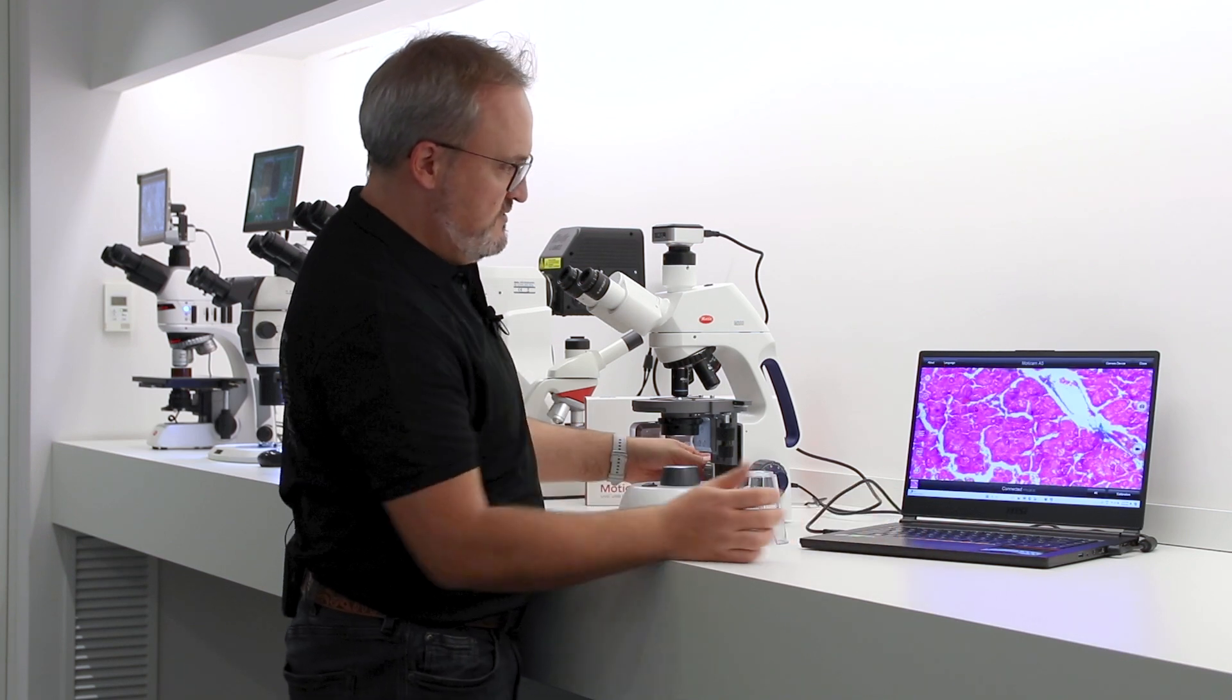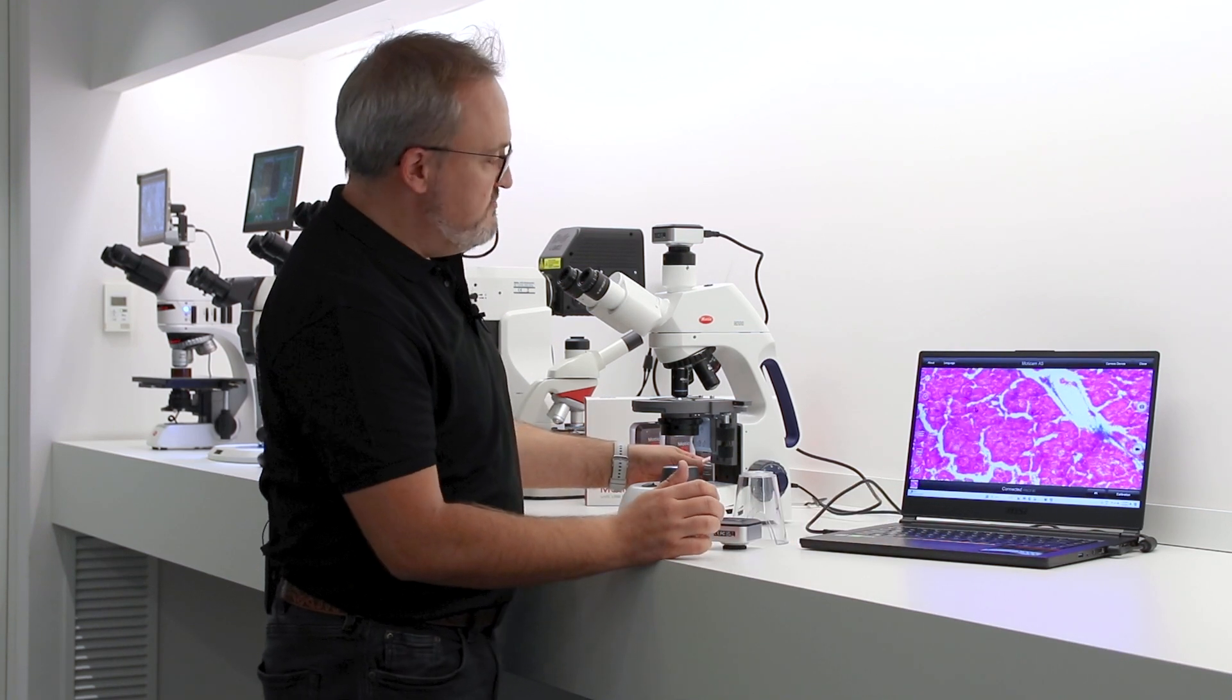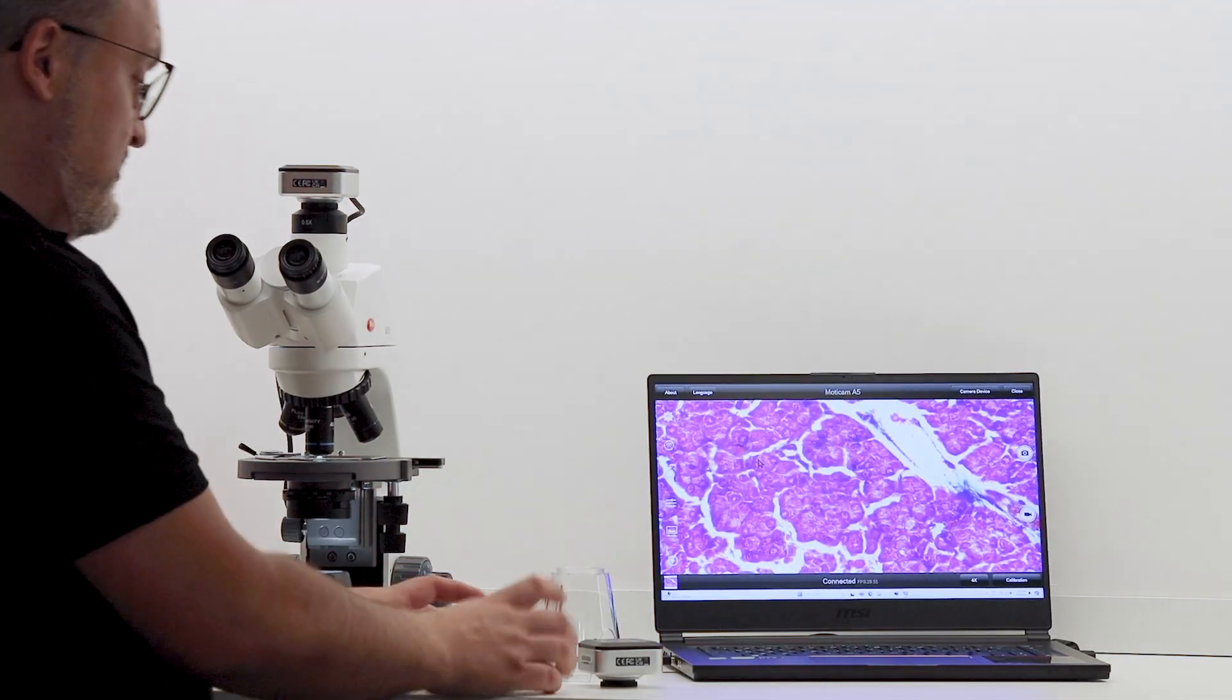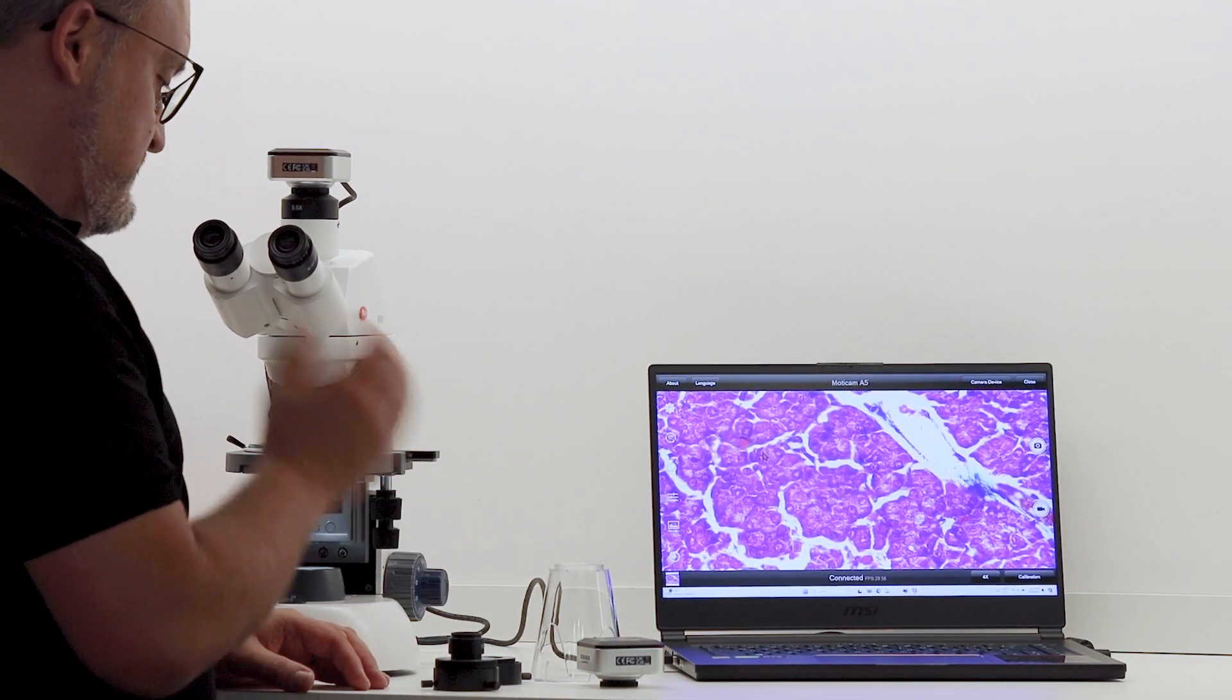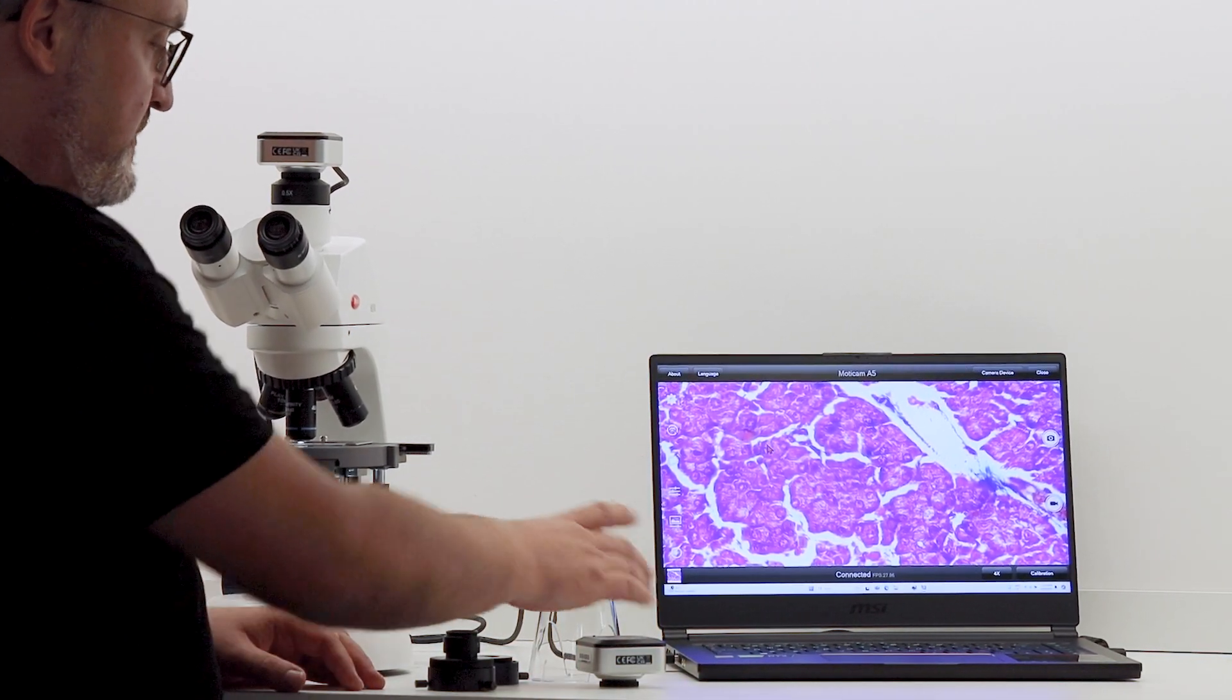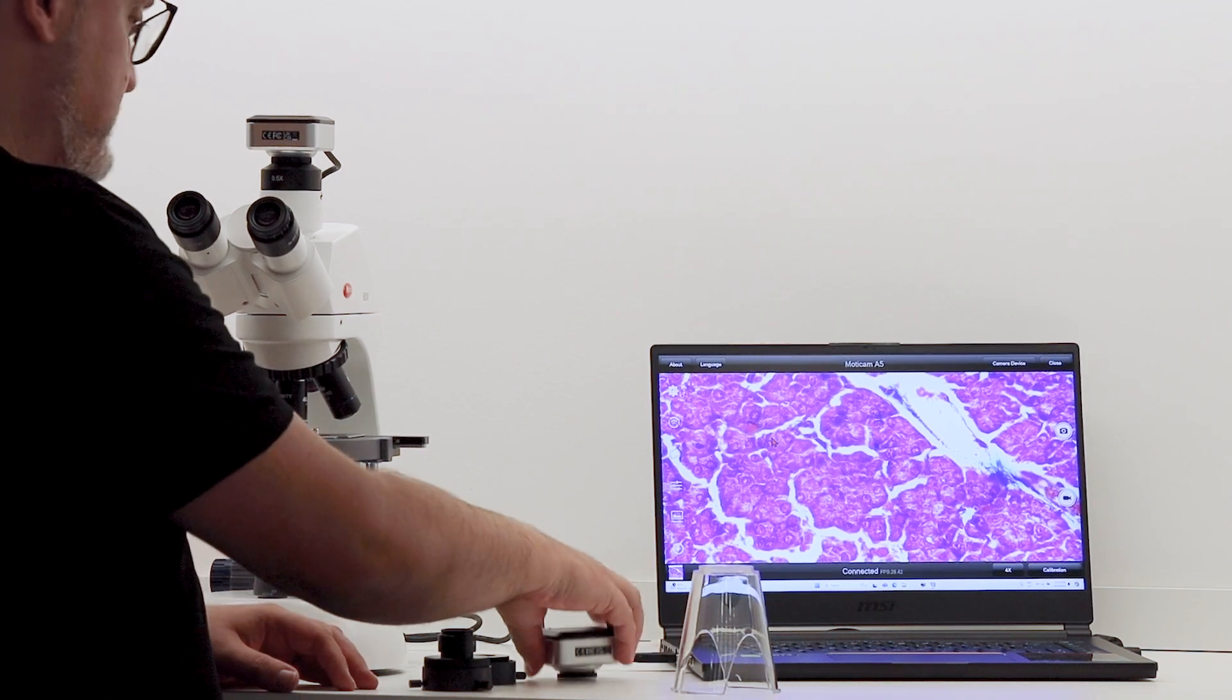I'm not going to save the image right now. Going back to my live image, as I said before with the all-in-one box concept, you get the focusable lens, two different eyepiece adapters, and the macro tube for looking at minerals, rocks, or insects.